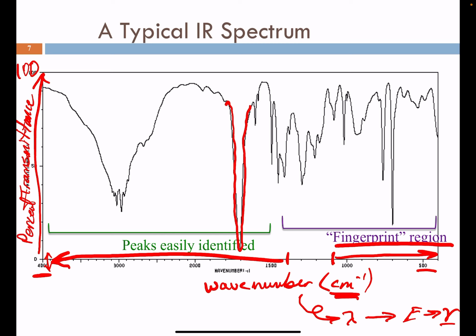And given the position of this peak, we know with great certainty that this is a carbonyl peak. Okay, and peaks, sort of inverse peaks, wells, very deep wells, shown more in the fingerprint region, are often harder to assign, but some are tabulated and can give pretty good estimates of the true vibrational mode present.